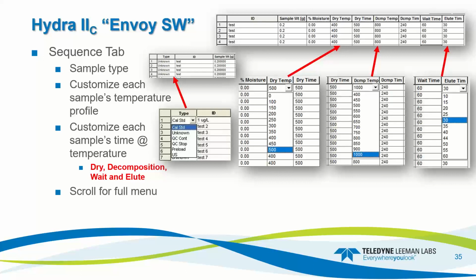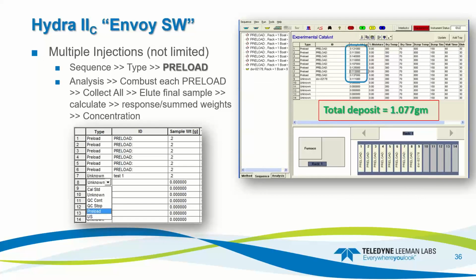This is where we would vary our drying time based on our sample weight. You can individualize it for each sample. And a lot of them have little drop-down menus, so you can just select the top box, and it will have the values you can select preloaded.